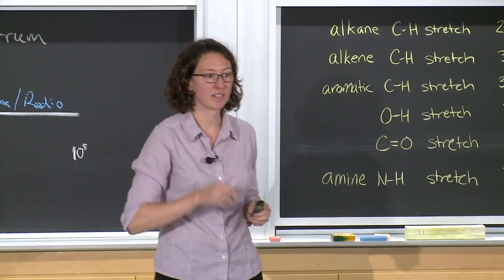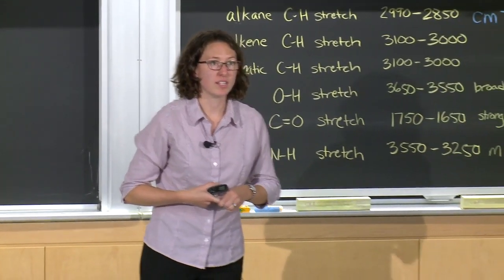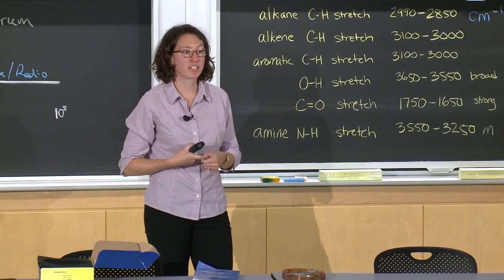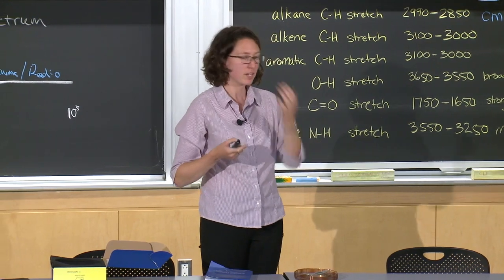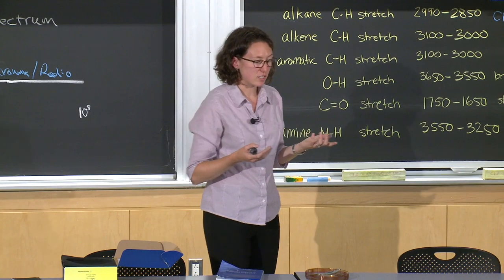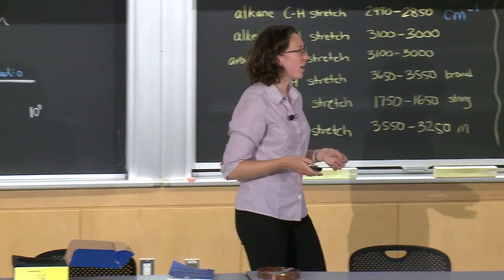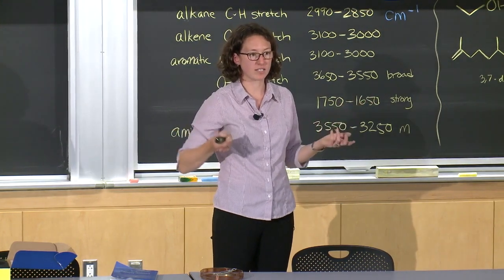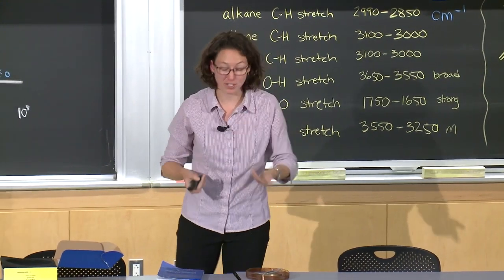Autumn: Why is gas chromatography better than HPLC? In this case, to be perfectly honest, I am not super familiar with HPLC. I'm sure you could also use it to separate these compounds. GC is, part of it is the techniques that we have available to us. But this also gets separated really nicely based on boiling point, so it's fast and easy for us to do. But yeah, we can talk about it more. It's a good question.